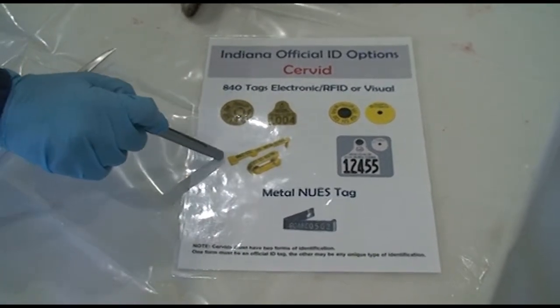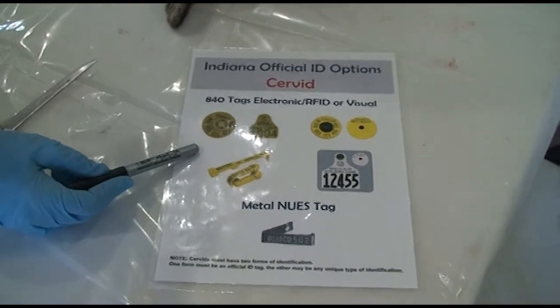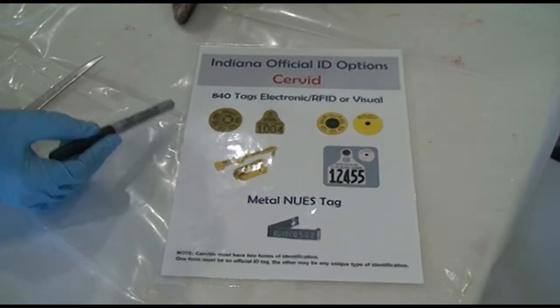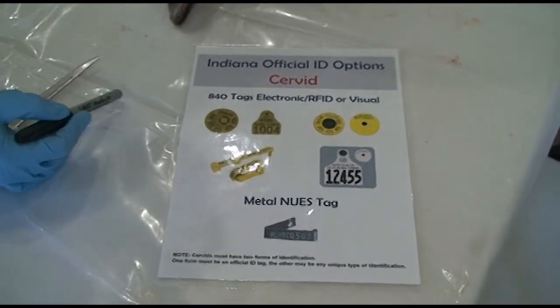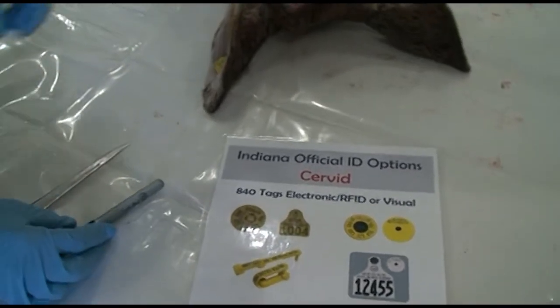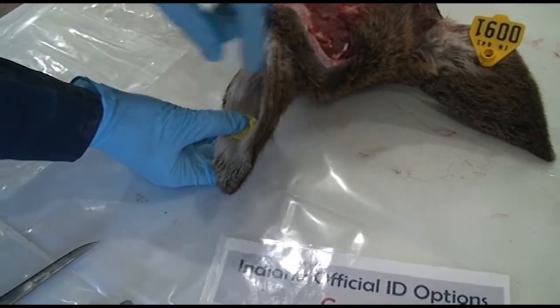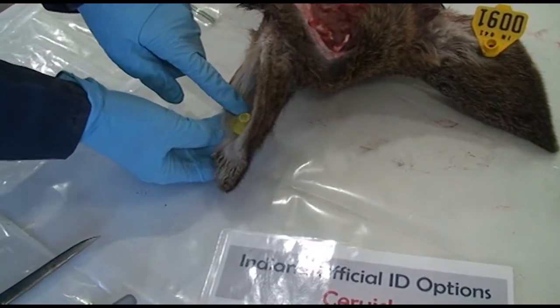And then the other tags are just farm tags that go with the deer. On the official tag, we want to send about a quarter size piece of ear tissue around the tag. So we want that to go with the tag, about a quarter size piece of ear tissue, with the tag still attached to it.